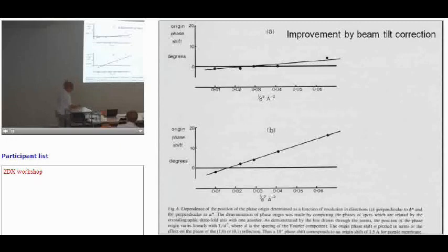And when you look into the beam tilt theory, there are 2 papers. Fritz Zemlin has one in 1978, showing that this is terribly important. And this is how the Zemlin tableau came up. And this is now all programmed into the microscope. So you now have coma-free alignment, and you just turn the knobs, and it does it. Hopefully, provided you haven't changed the height, it stays. But still, it's useful to check that that's true.